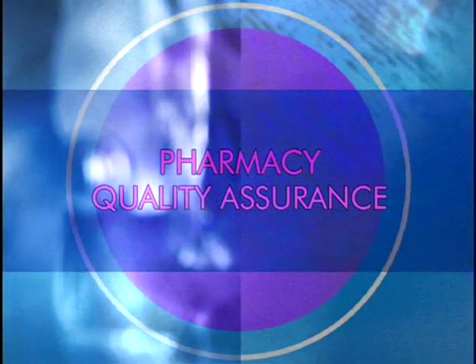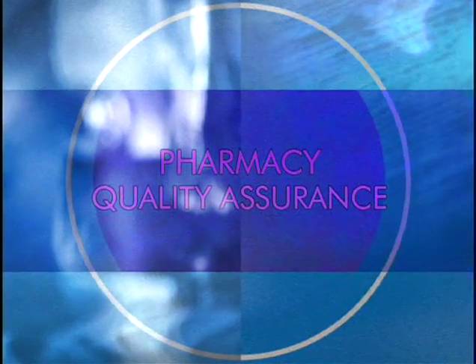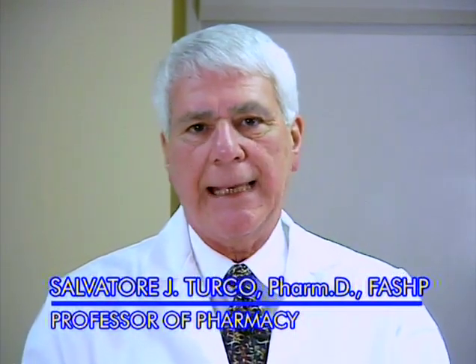A pharmacy quality assurance program must always encompass several elements, which include engineering and facility control, packaging and label control, laboratory controls, and personnel controls. Of these, the most critical is personnel control. A break in aseptic technique by pharmacy personnel can affect many patients. It is essential that personnel have the knowledge and the skills that are required to consistently produce quality injectable products.